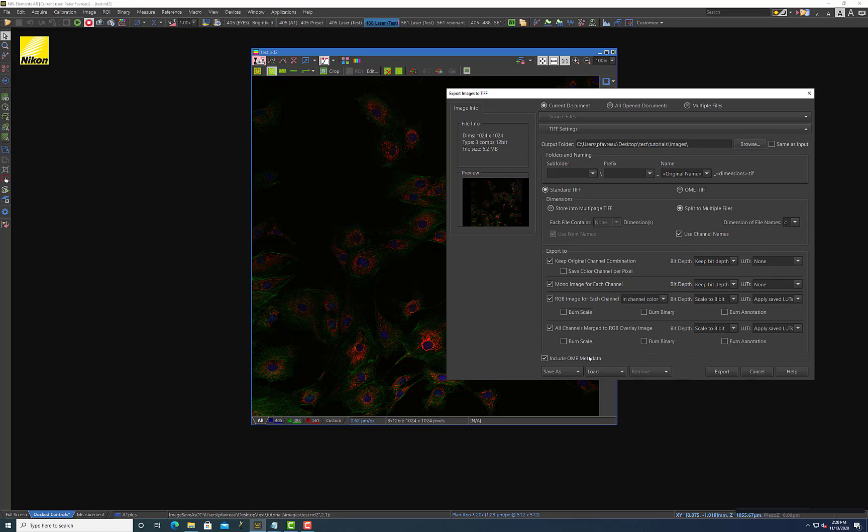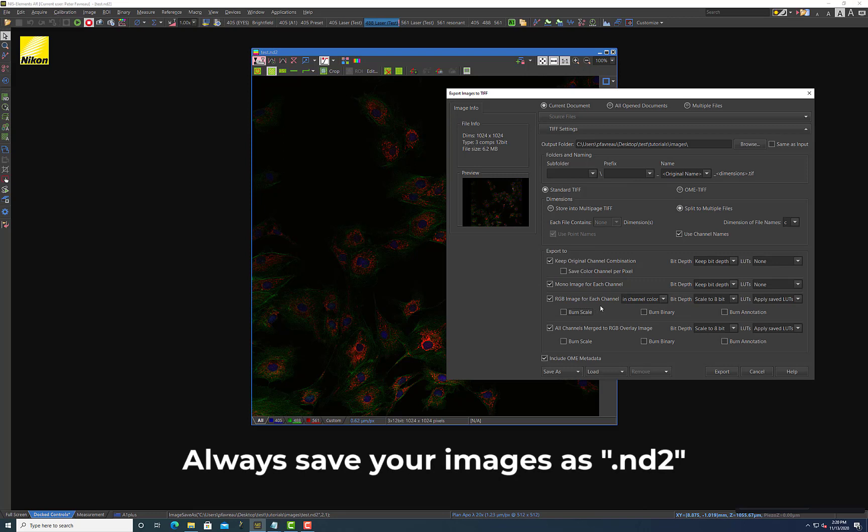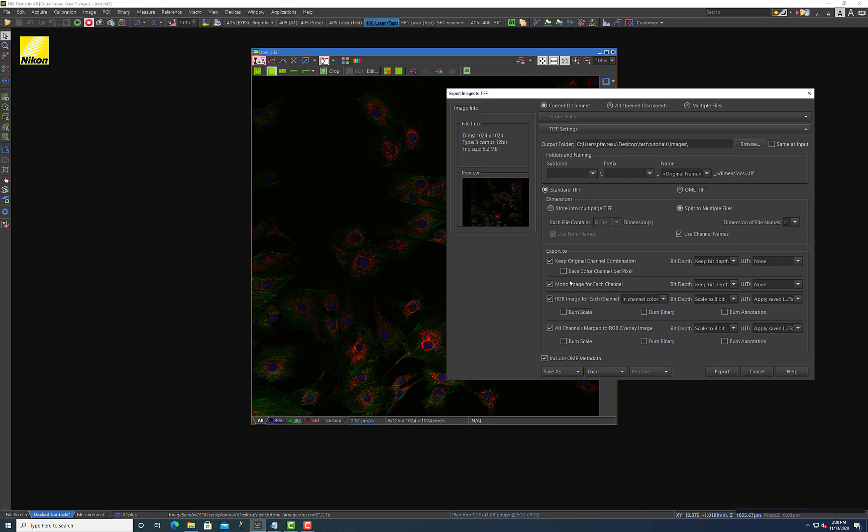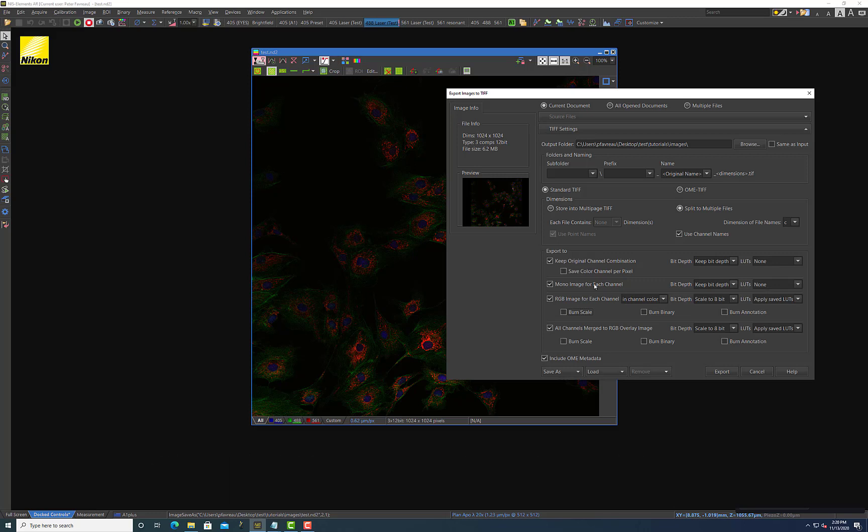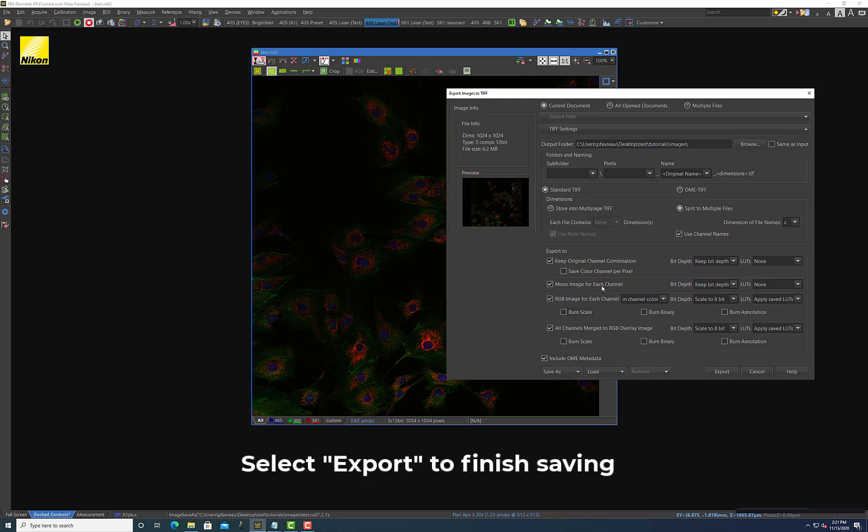So as you can see, there's a lot of different options here for saving your files and they all kind of do a little bit different things. I think as long as you take away from this video that first you want to save your file as an ND2 file so you can come back here anytime and save the images as you want. And also that if you do end up saving files as TIFF files, I highly recommend always saving a mono image for each channel just because that's the most segregated and reproducible way of doing quantitative image analysis on your images without using the project file.